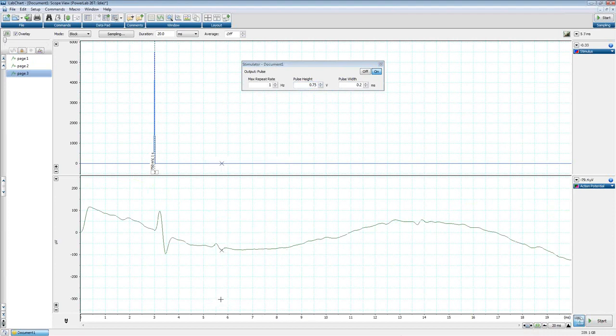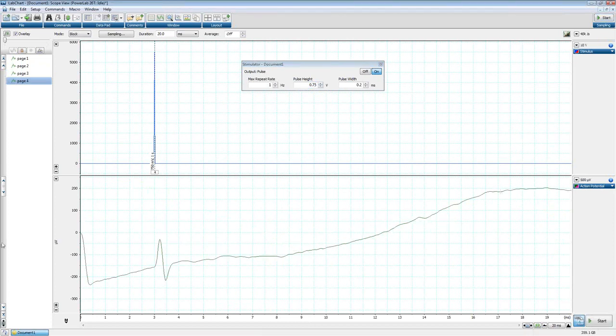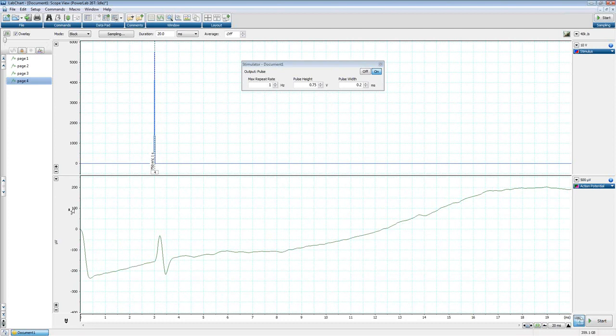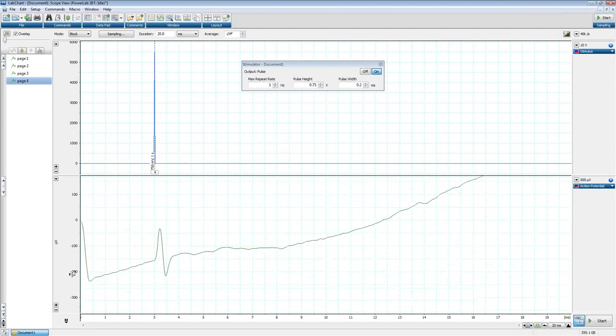And there's our response. Let's see if that's repeatable. Oh, maybe not. When we see a big dip, right, a big offset here, probably because we're pinging away a little too quickly. When this happens and you see a big offset at the start of the recording, have your students slow down a little bit. I get impatient as the next guy. We start clicking away and we end up with these large offsets that can significantly obscure the signal. That, and I think my Earthworm here is just about given his all.